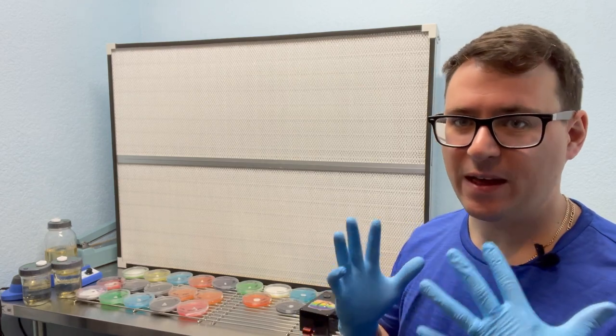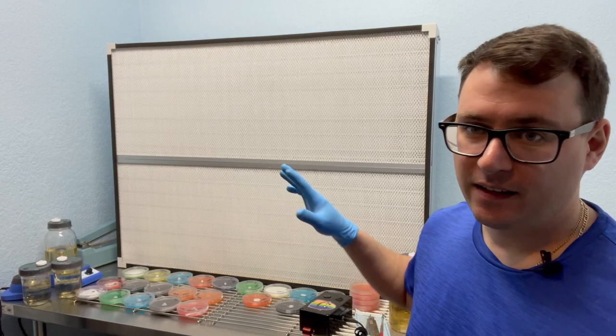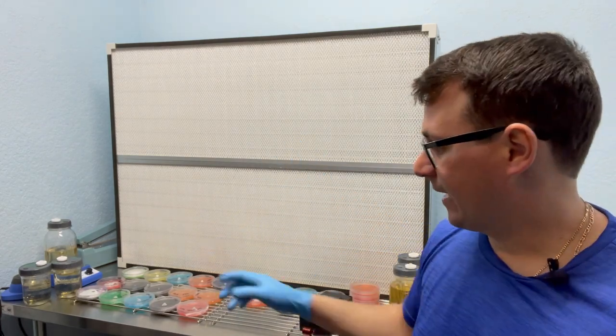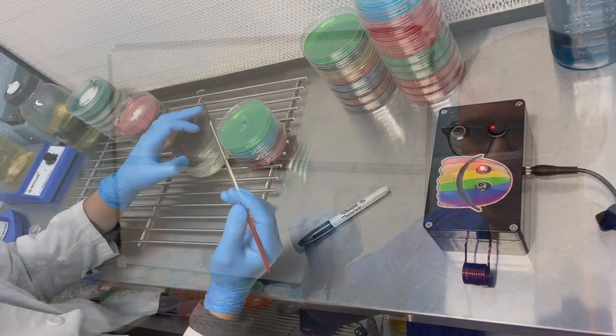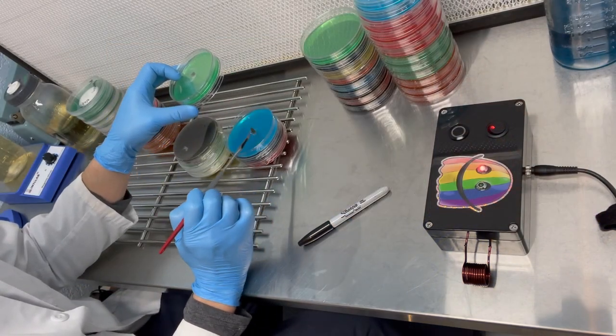Okay everyone, so it's been 3 days and the verdict is in on the mycoGeeky induction sterilizer, and it looks like we have 100% success. There's a little hiccup that I'll show you, which is just a technical error. When I was making a transfer, I dropped one of the wedges not in the middle of the plate, and you can see the result from that.